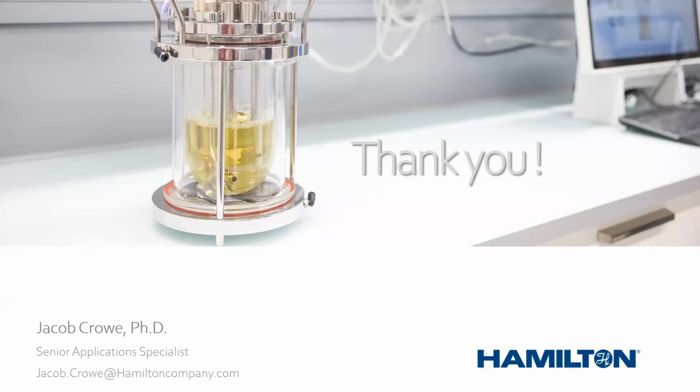How does the system compare with the 90-degree turbidity system when measuring NTU? I actually cannot comment on that. I'm not sure about the answer on that one. My assertion would be if the 90-degree NTU system has a high degree of linearity throughout the duration of the process, then I would say it's going to be comparable to our measurement parameters.